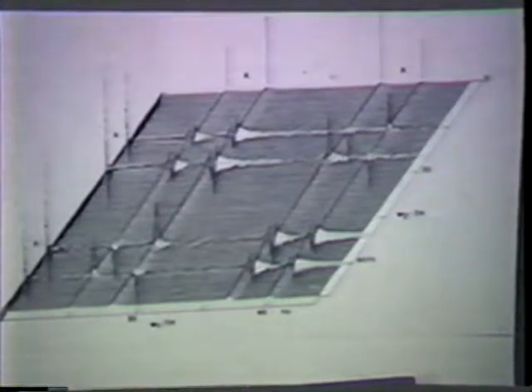We have the diagonals here and the cross peaks here. You see the cross peaks are of about the same intensity as the diagonal peaks, 1, 1, 1, 1, except that along the diagonal it's slightly different between these two, and this is because of a little bit of strong coupling mixed into it.